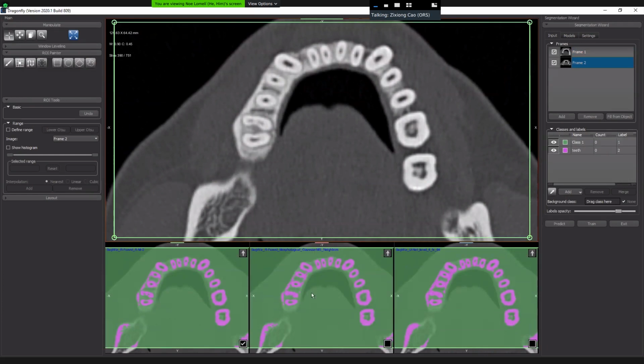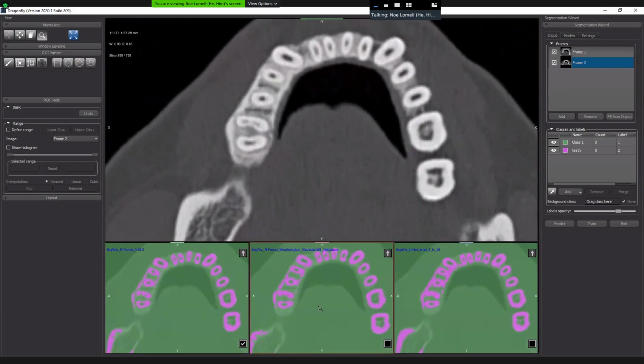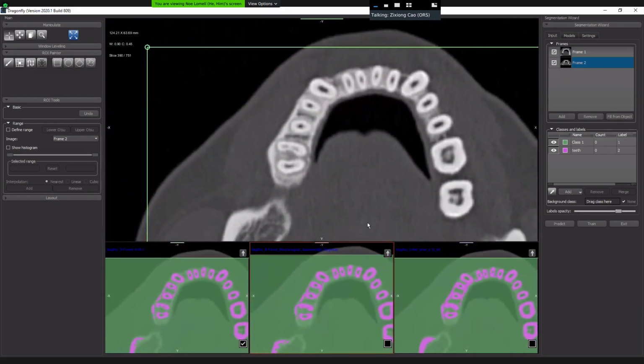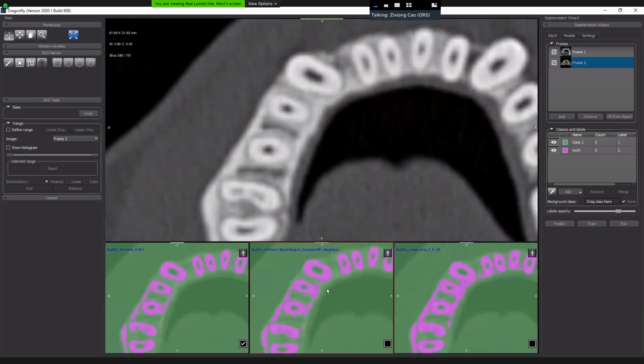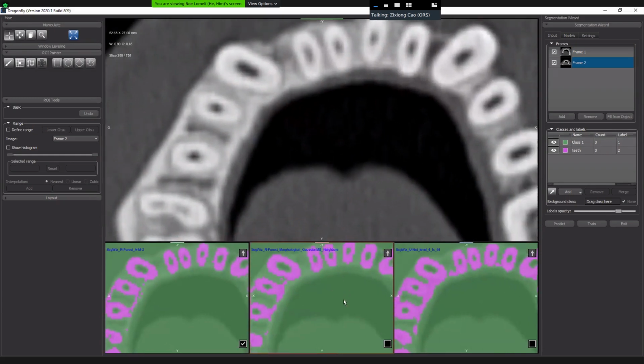Yeah, most of the prediction looks kind of accurate. It gets most of the teeth because you have only 1 frame and you didn't train many epochs. So of course it's not a perfect model yet. You see here that there are a lot of mistakes, but still it worked for some teeth. Like here, it was pretty good.